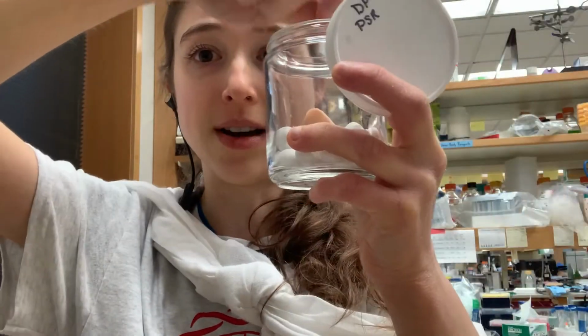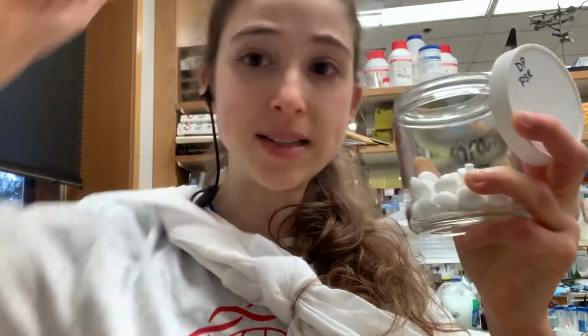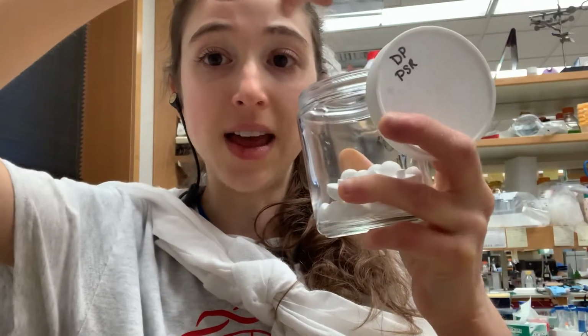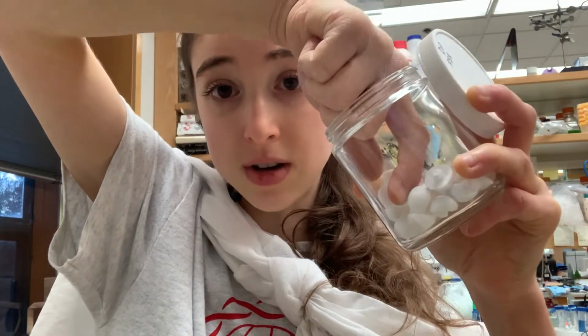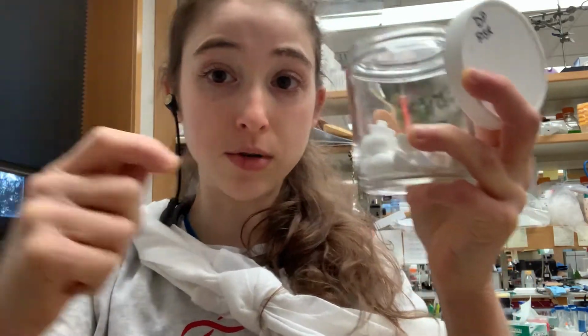So if you have an external proton added, then you want your buffer to be able to act as a base and take that proton. If you have an external base that is going to take a proton, you want your buffer to have an acid that can donate a proton, so that your proton level stays constant, your pH stays constant. In order to do this, your buffer needs to have about equal amounts of the acid and the base form.